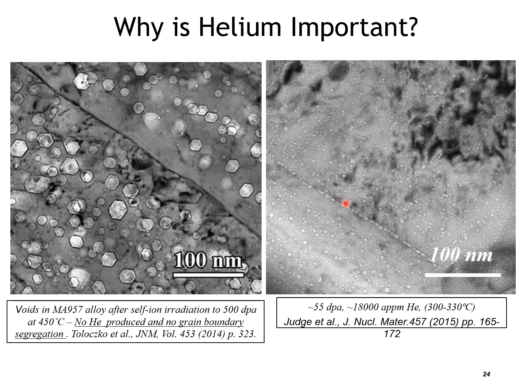So simply because helium migrates to and sticks on the boundary means that you get more vacancies migrating to the boundary and giving this perforated structure.